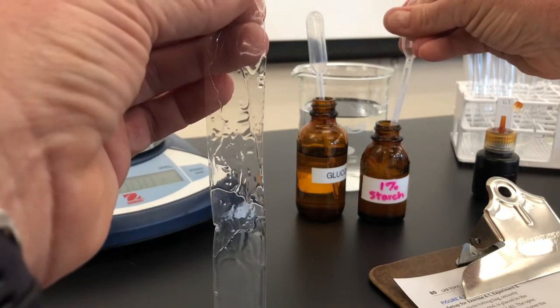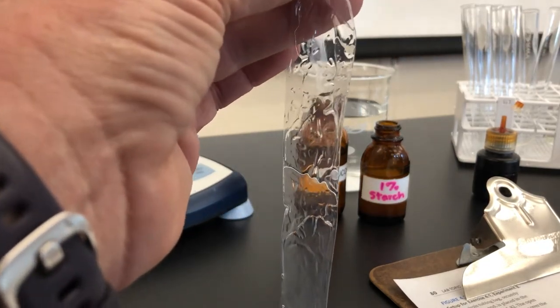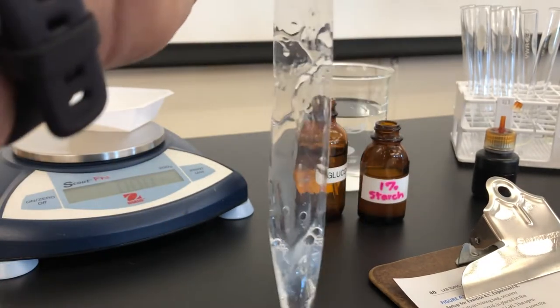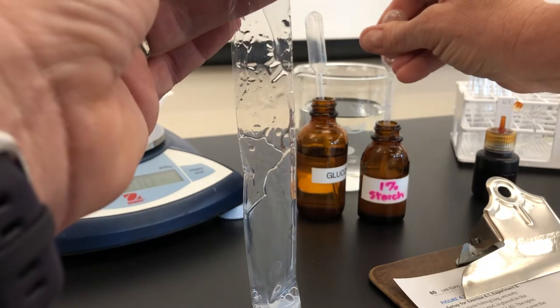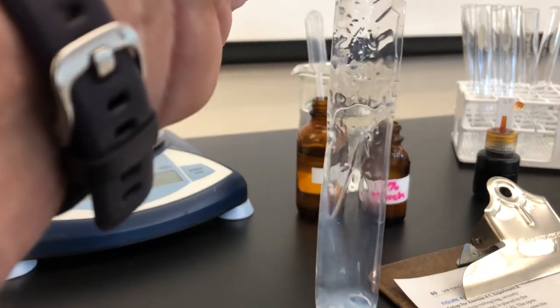Now for our starch. Note this starch is a little more cloudy where the glucose is very clear looking. If you recall these are both carbohydrates. One is a simple sugar and one is a complex sugar.